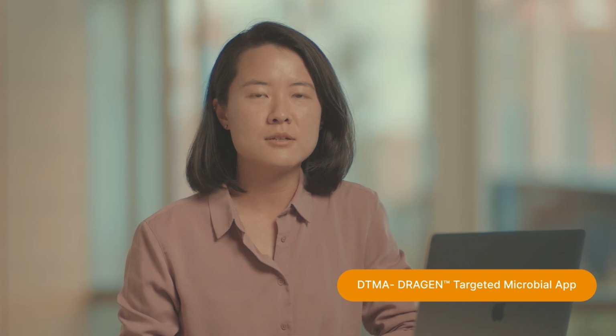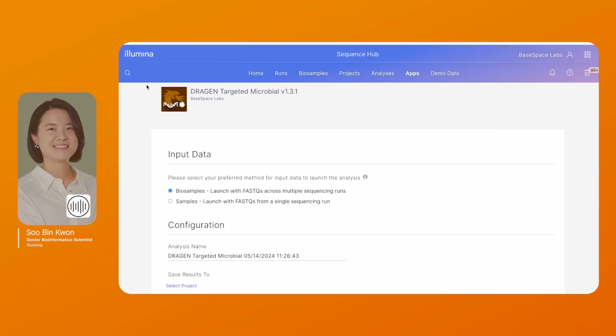Today I'll introduce DRAGEN Targeted Microbial, an analysis software for hybrid capture enrichment panels and amplicon assays like IMAP flu and COVID-seq. As input, the app takes FASTQ files consisting of sequencing reads, and as output, it generates consensus sequences out of those reads. Lastly, it also runs Pangolin and Nextclade, which provide clade and lineage information on those consensus sequences. Here's the input form shown when you launch DRAGEN Targeted Microbial.